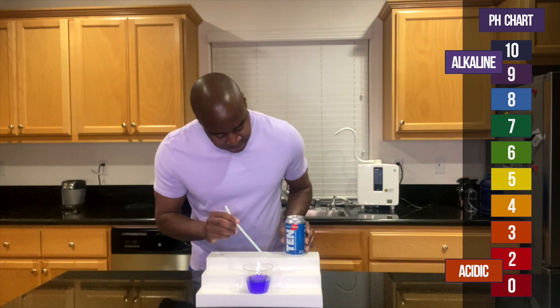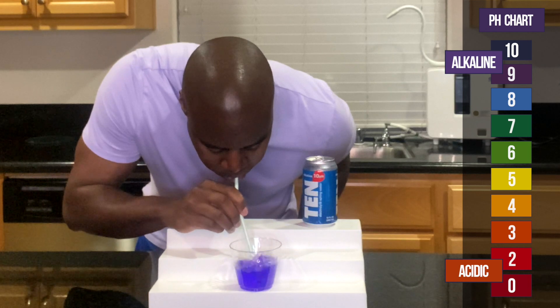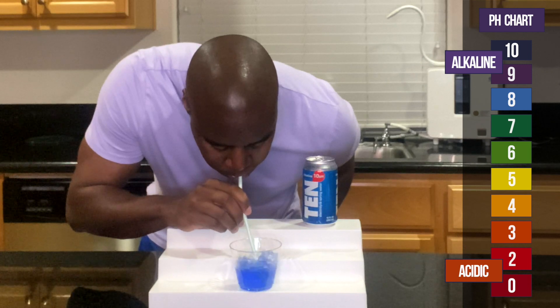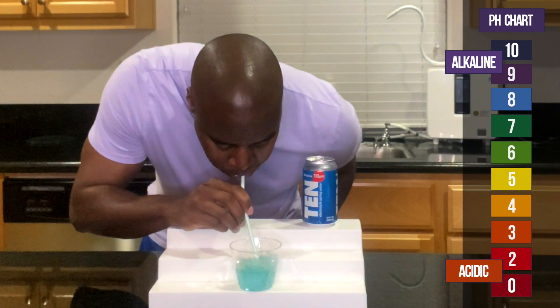Let's put that there. Let's go ahead and add these drops. There's no other drops.